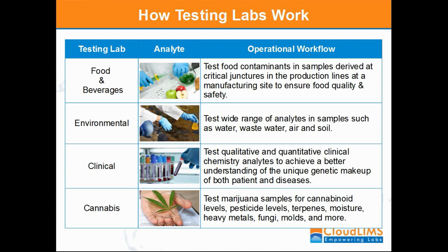These labs perform diverse qualitative and quantitative clinical tests and deliver the test results to clinicians and physicians, in turn helping them to evaluate and achieve a better understanding of the unique genetic makeup of both patient and diseases. Many times, specific clinical tests are outsourced to distant clinical labs having multi-specialized facilities so that the test can be performed with utmost accuracy and in minimal time.